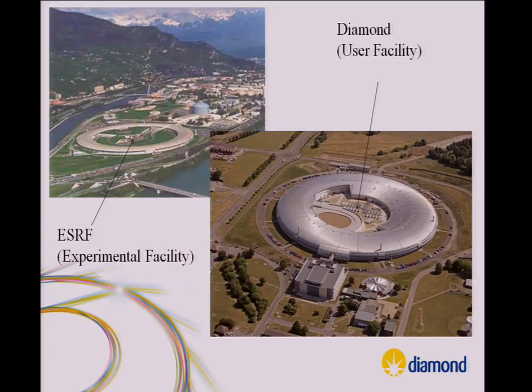How big? It's about 750,000 lines of code at the moment, but it's growing quite fast because last year it was 500,000. Which license? Some of it's EPL and some of it's Apache, but they're both permissive, so you can use them commercially. We welcome commercial partners. We are funded by taxpayer money, and we'd very much like to have some commercial partners. That'd be great.